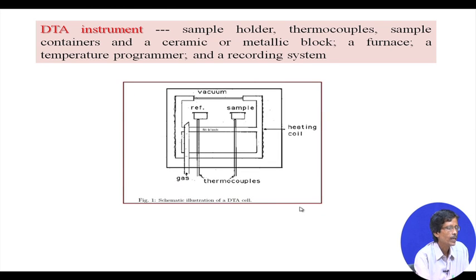So, typically, a schematic for a DTA chamber has an enclosed furnace.